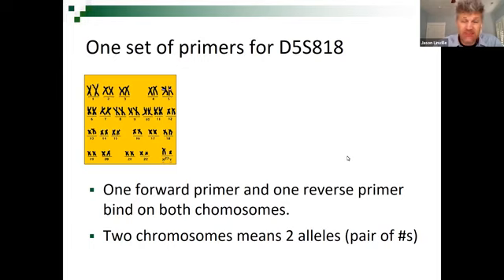The DNA, here it's my DNA, but if we want to amplify like a disease gene in my DNA, then it would still be my DNA. So my DNA, or the person's DNA, is going to change depending on who you're trying to get the profile from. So when we go from just generic PCR to amplifying D5S818, I want you guys to recognize the only thing we need to change are the primers, right? Because the sequence of the primers is what controls the area of the DNA that those primers attach to. So if we're amplifying D5S818, we need to choose primers to amplify D5S818.